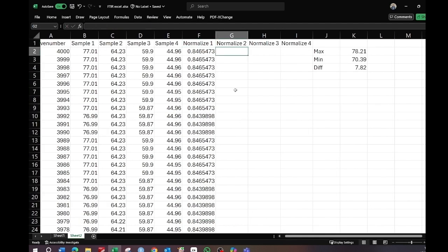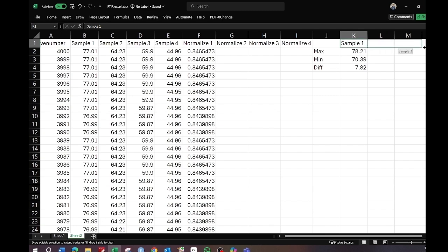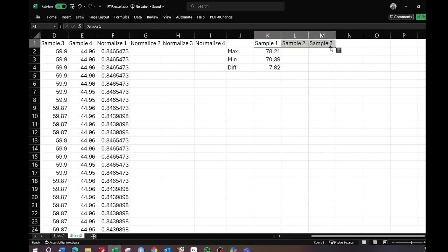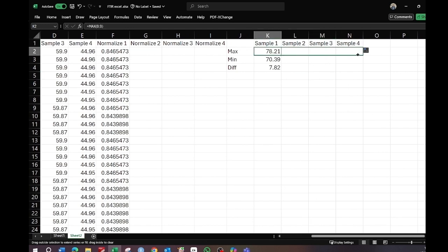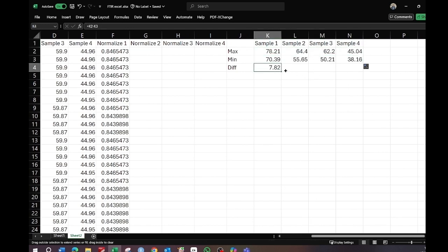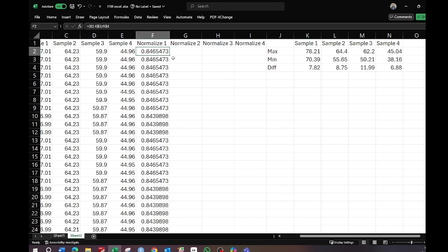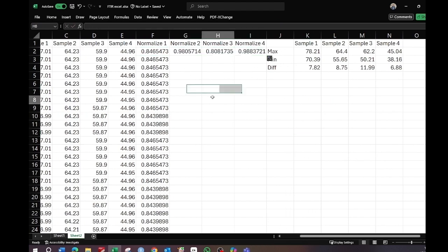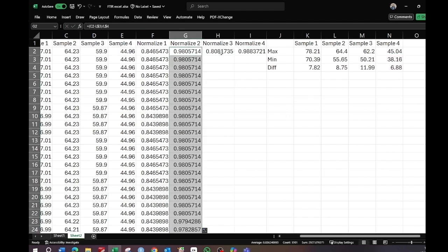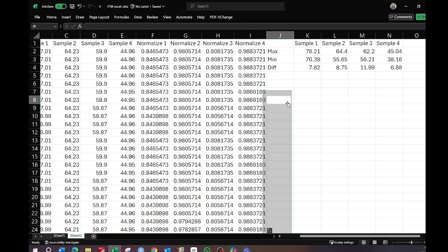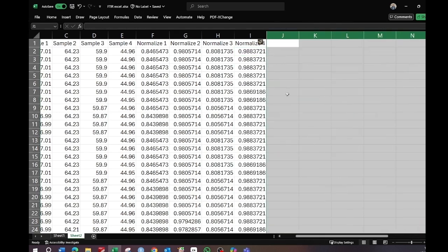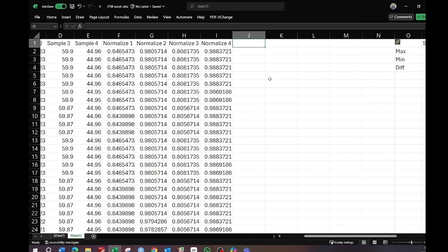This is done for sample one. You need to do it for all of the samples. Drag this one and it will bring the maximum and minimum for the entire range — this is for column C, which is sample two. Drag this one and bring it here; it will automatically apply the formula. Double-click and it will normalize the data for the entire range.